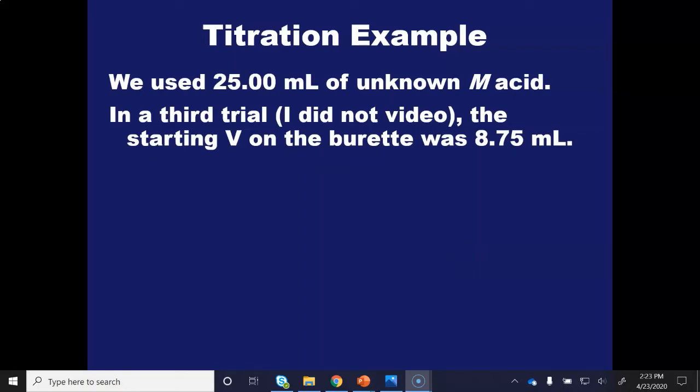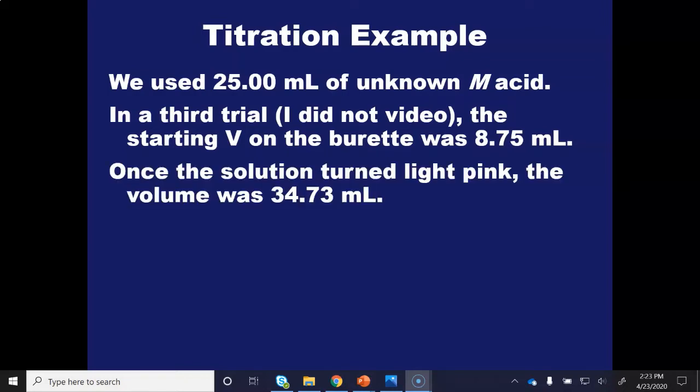And the third trial, which I didn't take a video of, the starting volume on the burette was 8.75 milliliters. And once I got to that light pink color, I looked at the ending volume and it was 34.73, just a little bit past the 0.7 line.